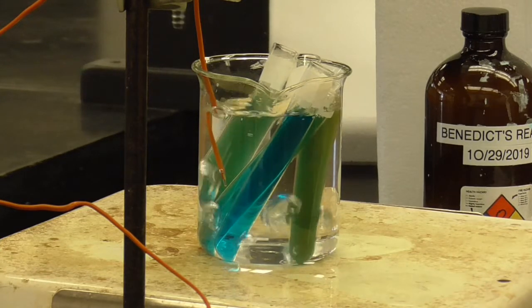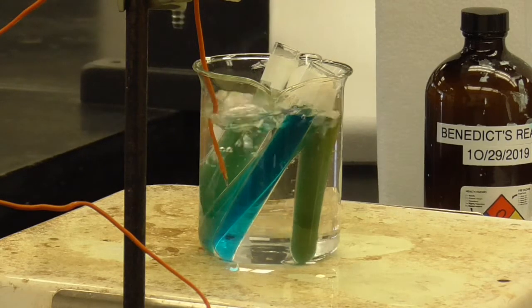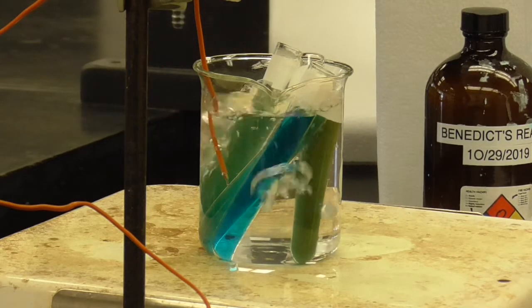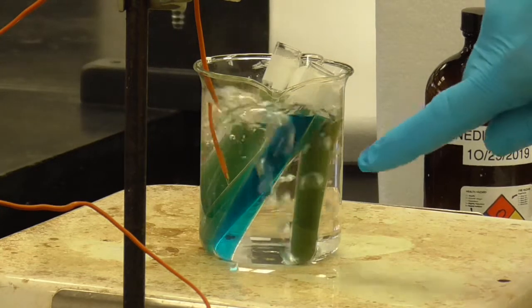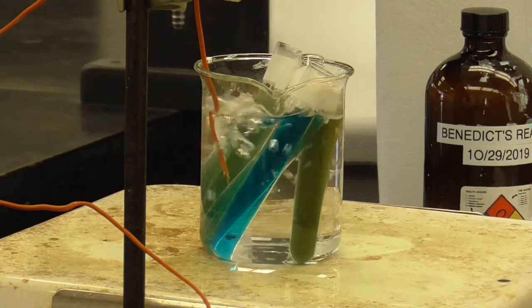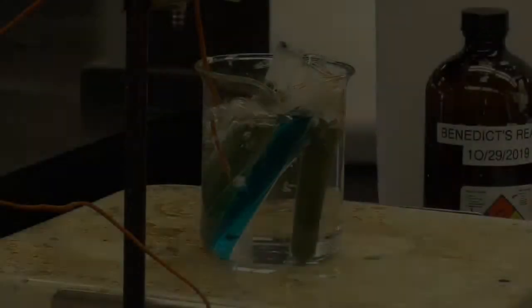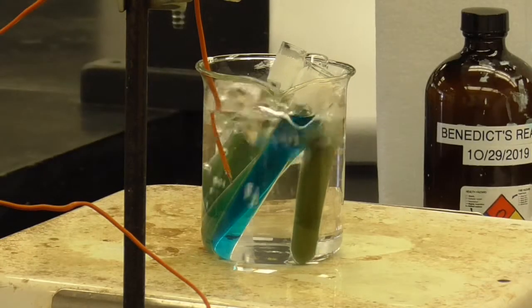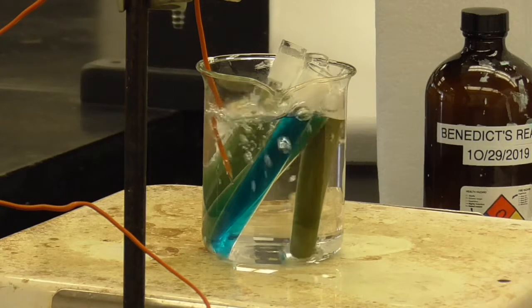While this continues to heat, I am going to go grab a tong or something so I can take these test tubes out. Oh, actually, Dr. Shin will do that for me. You already see some color changes happening, I think, in these test tubes, but we'll give it a full 3 minutes. We're only at 1 minute and 20 seconds so far. We'll give that a full 3 minutes for that Benedict's reagent to work, and then we'll take those test tubes out so we can see the color of them.